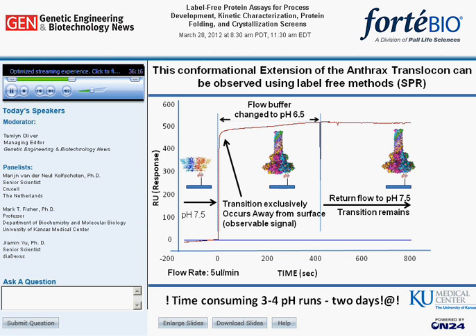We initially employed surface plasmon resonance to measure this transition, and indeed documented that we could view this transition when we specifically orientated the pre-pore conformer onto the SPR surface and examined the transition as neutral buffer was replaced with buffers that approached endosomal acidification conditions. This transition occurs rapidly, and once transitioned, the conformation remains locked in its pore form once flow is returned to the neutral conditions. Although successful, these series of SPR experiments were extremely tedious and time-consuming.